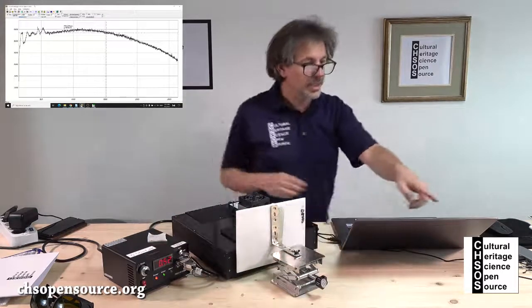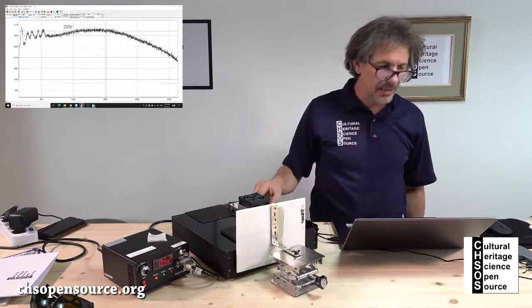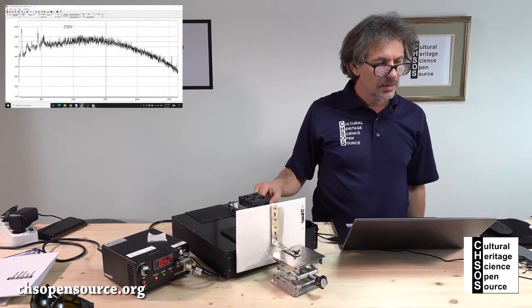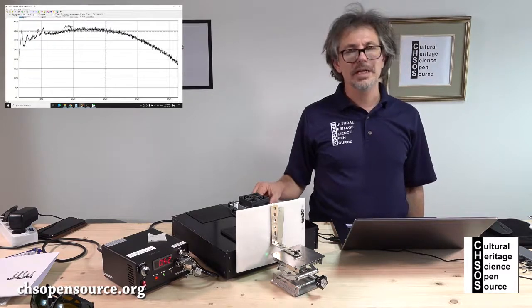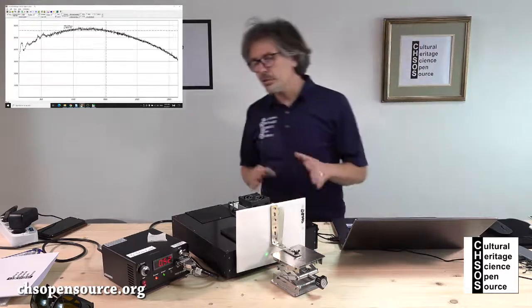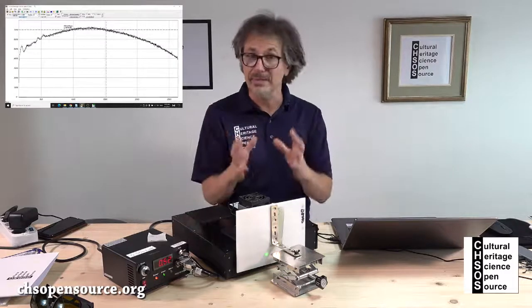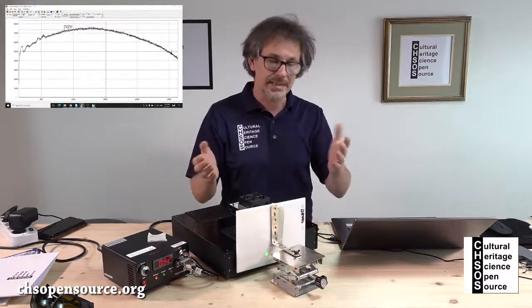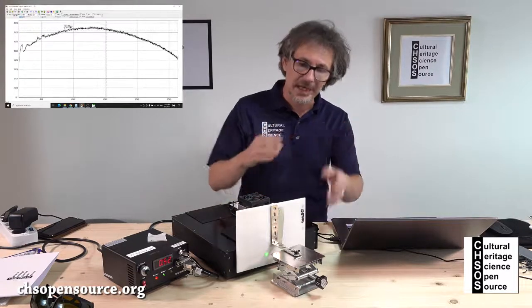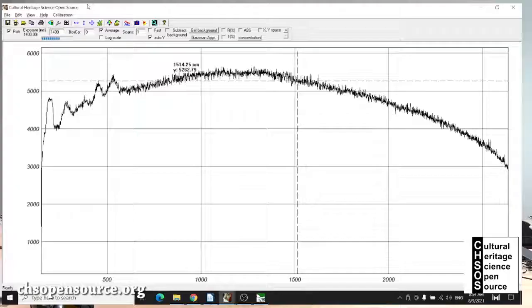Okay, we look here at the monitor. So right now the slit, let's do the slit all the way open. Also, to work with the slit keeping it open, since I collect more Raman signal, also the fluorescence, it's a better way to get a lot of signal, so to check rapidly the focusing process if we are going right.